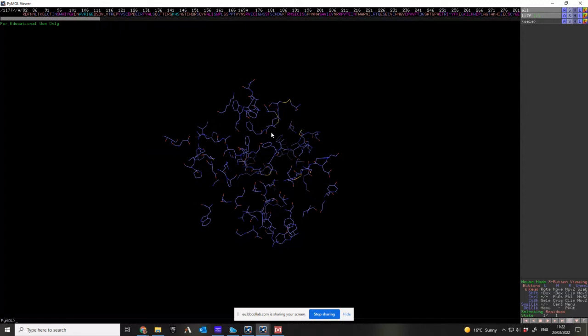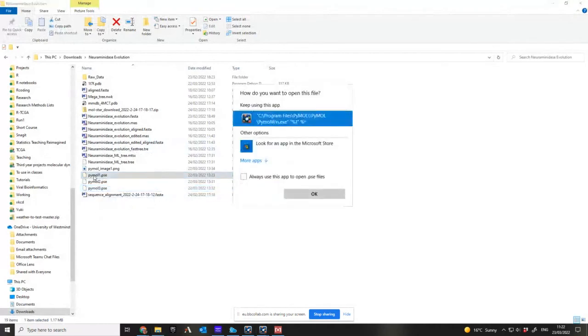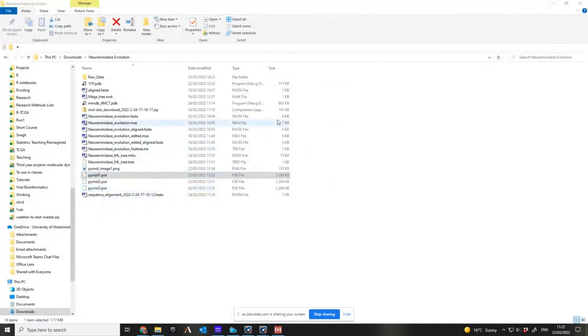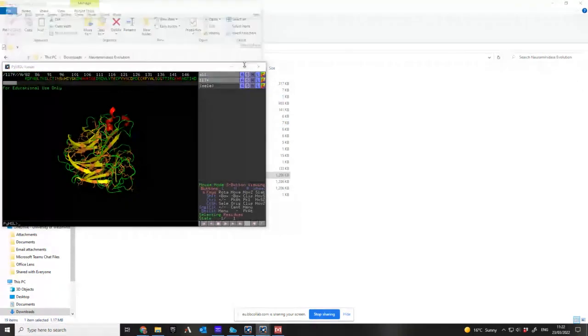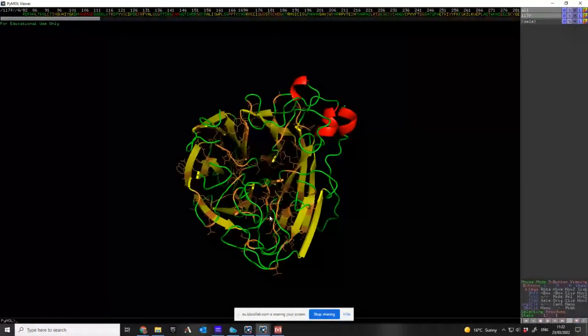You have to look at the hemagglutinin and identify the bits of hemagglutinin that are important. Now, in neuraminidase, the shape is not very exciting. So as I told you, it's what we call a sort of beta barrel.